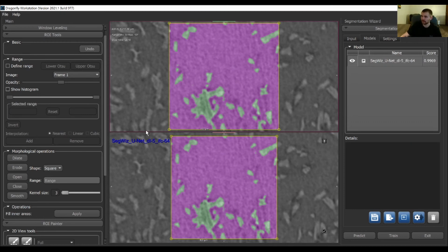So what it defaults to immediately is it sends you this split screen. You don't need to click this for now, because what this is basically showing you is what its prediction is for how it would segment this training frame. And it's going to look pretty similar for this, but you can see some differences. Like right here, it's calling that fiber when I didn't. So it's got a few problems, but for the most part, it looks good.